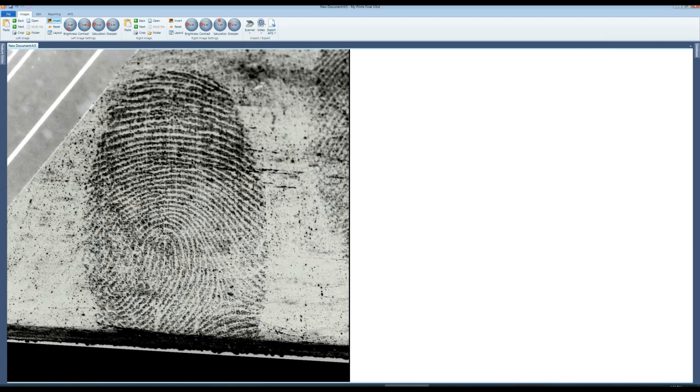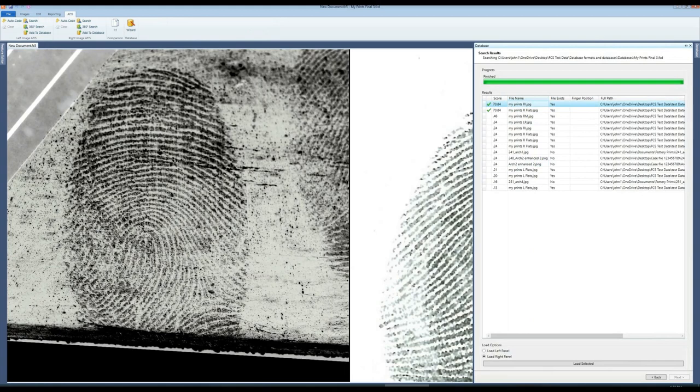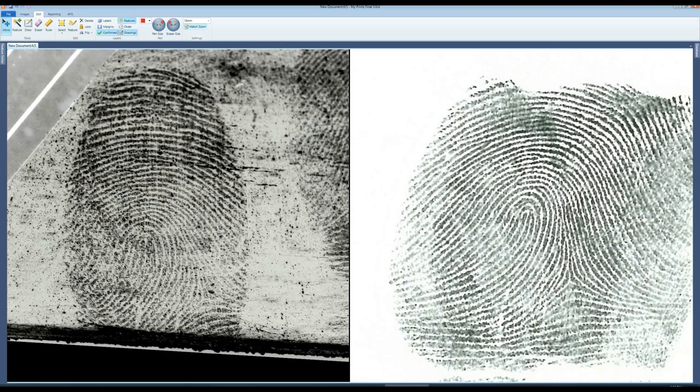Search the APHIS. Select the first candidate. Position to commence the comparison. And then commence the comparison process.